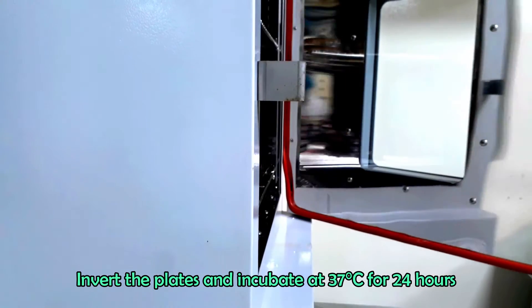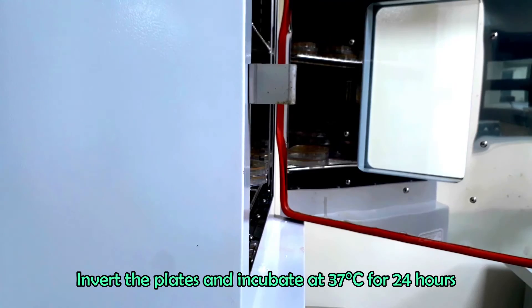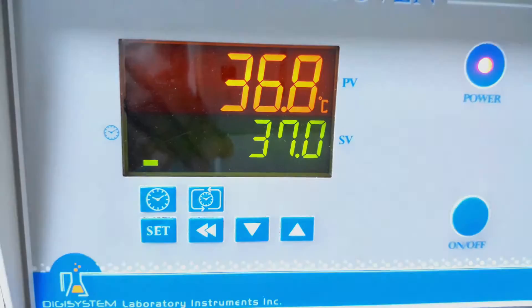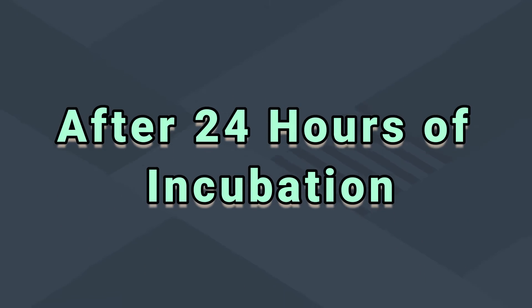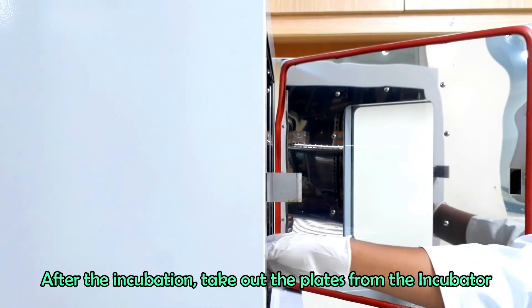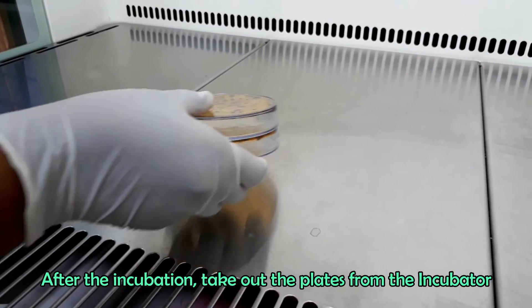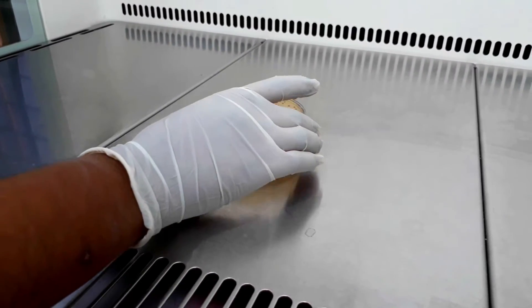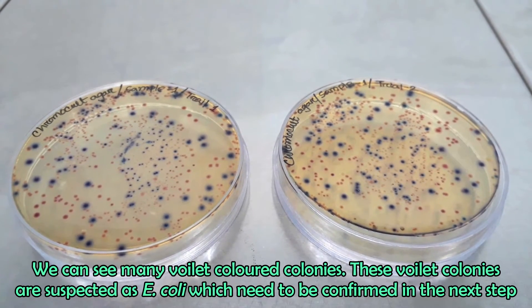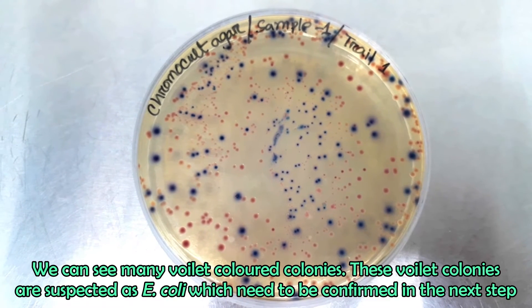Incubate the plates at 37 degrees Celsius for 24 hours. Take out the plates after incubation. We can see many violet colored colonies on CCA plates. These violet colonies are suspected as E. coli, which need to be confirmed in the next step.